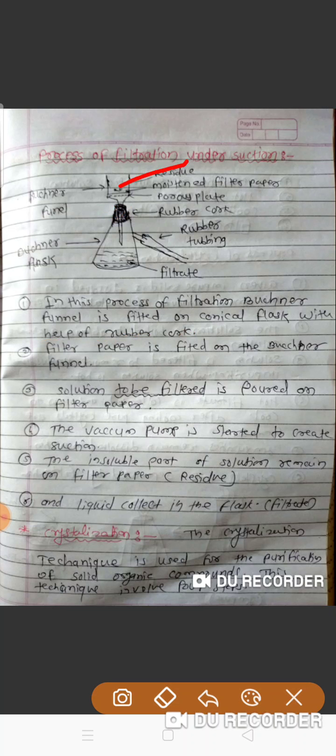The solution which is to be filtered is poured on the Buckner funnel. From here, we can pour the solution to be filtered onto the filter paper. The suction pump is started to create the suction, and when we pour the solution onto the filter paper, the pump should be started.